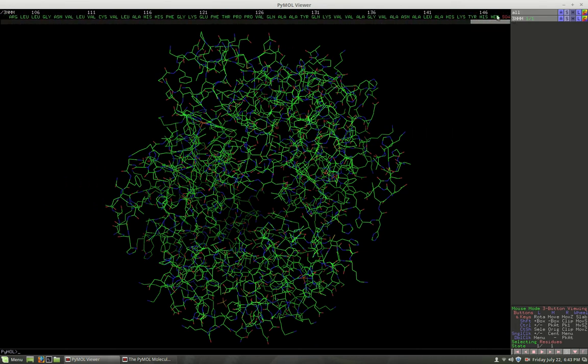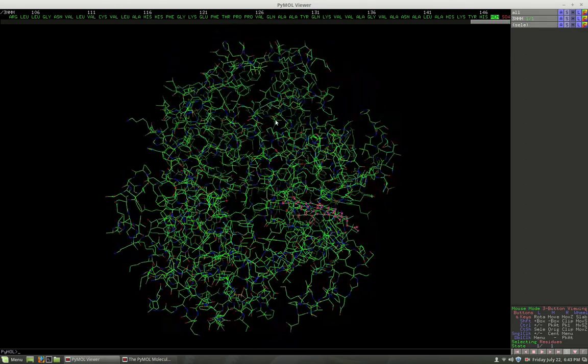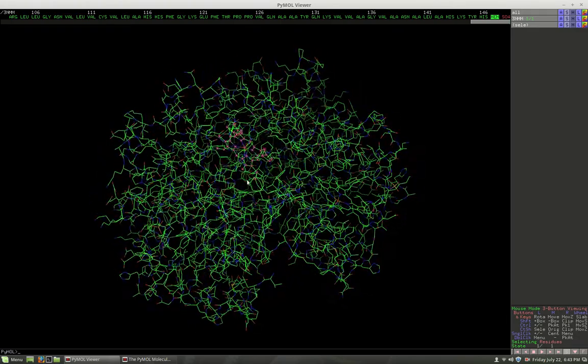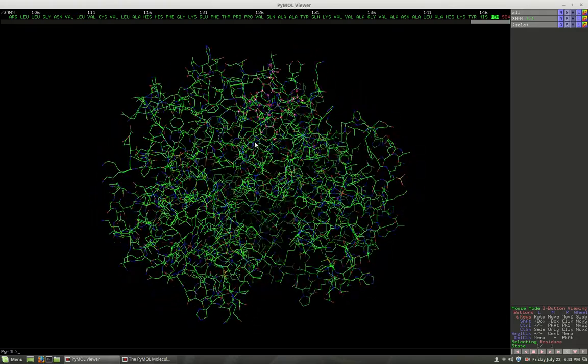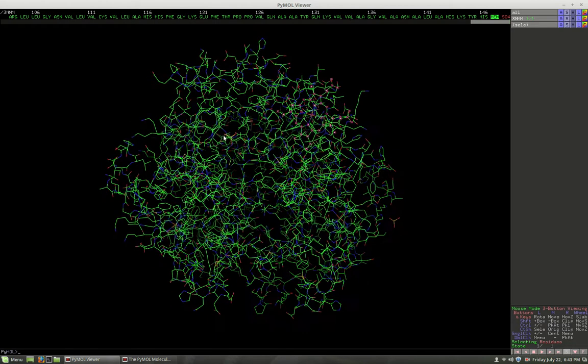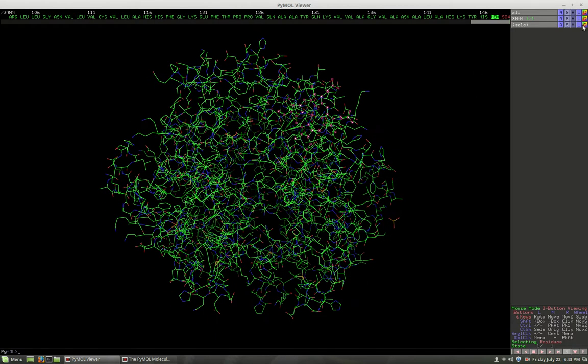And there's something called a heme in here. So what is the heme? That is this piece right here. And if you know anything about hemoglobin, that basically is the heme group of hemoglobin. So this is exactly what this is. This is hemoglobin here. And let's highlight that.